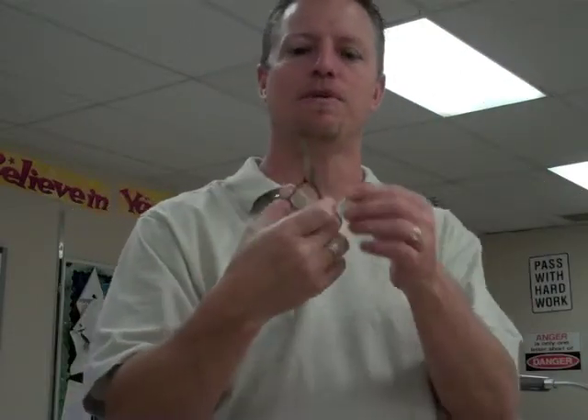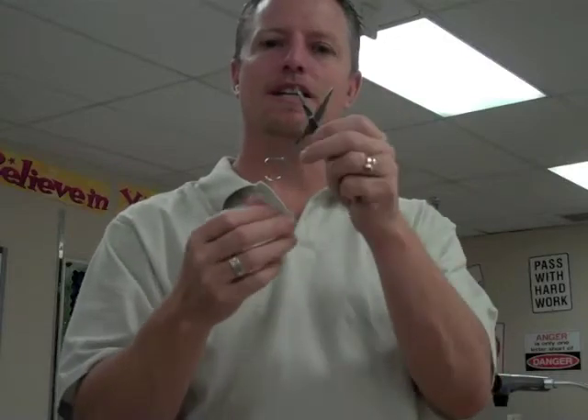These are just scissors — you can call them dissection scissors, but we use them for different things, mostly in dissections. They're really useful for cutting away the top layers of tissue when opening up an organism, or if you need to remove an organ, you can clip away different parts to get it out.